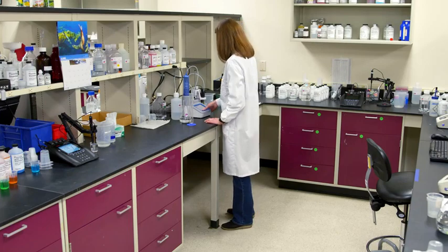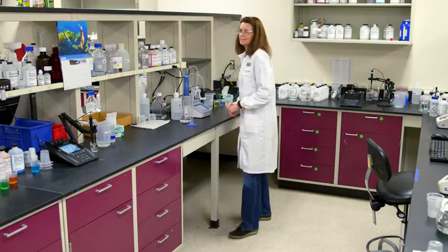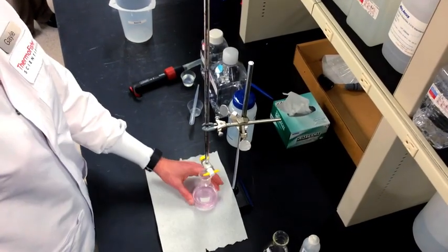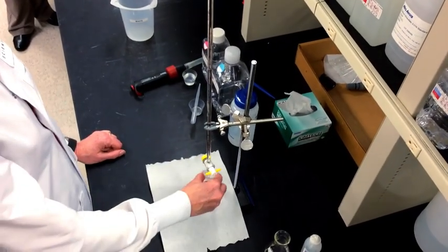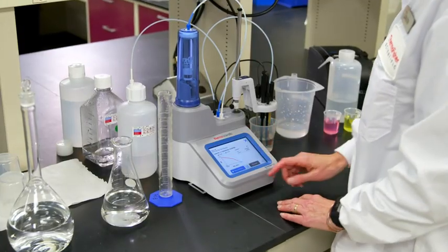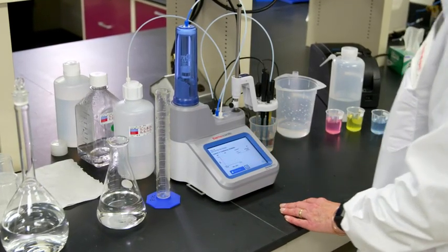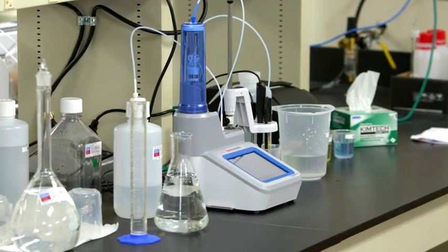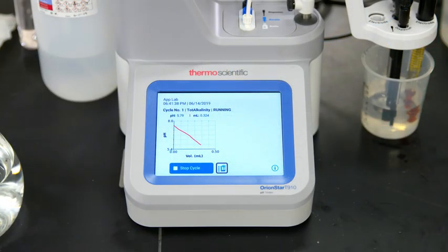Now that the titrator is set up, we'll get it running. I used to have to stand in front of my burette and manually titrate to a color endpoint. But luckily now, this automated titrator allows me to start it up and walk away during each titration. Meanwhile, the titrator is taking measurements. Now I can accomplish more in the same amount of time.